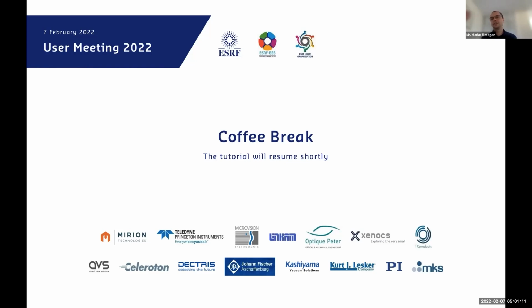And maybe to go one step further, as I said in the beginning of the presentation, there are quite a few tools with user interfaces that do data reduction for absorption and XAFS, but not that many that do it for X-ray emission and RIXS.